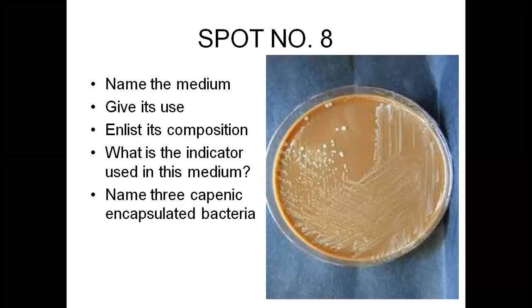Please make one thing very clear, that we are not putting bacteria on the culture plate. We are putting the sample on the culture plate, and we are actually putting the sample to identify the bacteria. When we put the sample, we are going to come the next day after 24 hours, and then we are going to see which bacteria is on the plate, and we are going to identify it through biochemical test and staining.